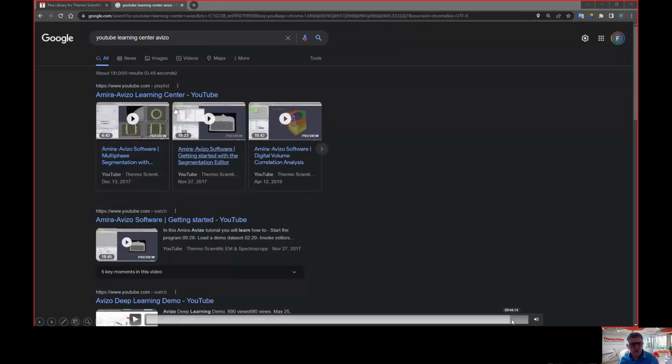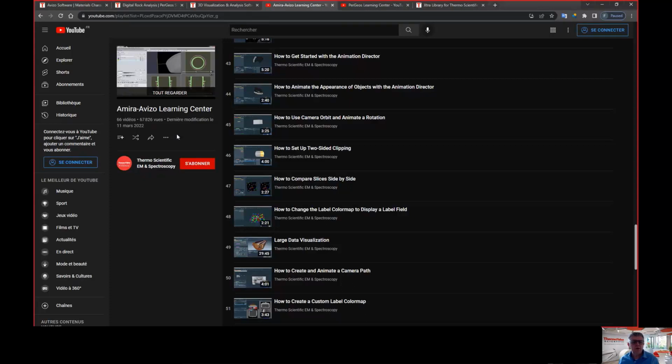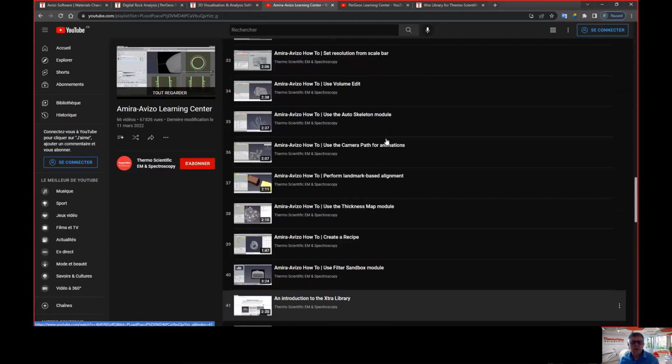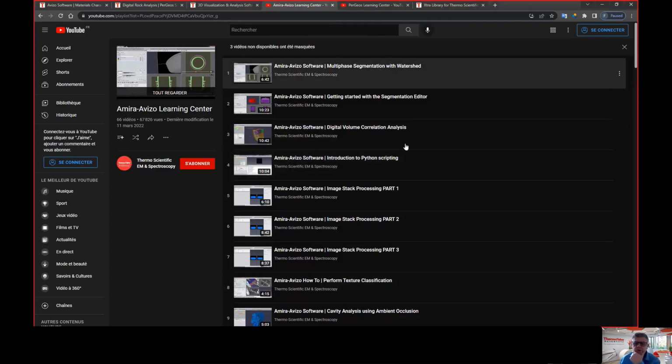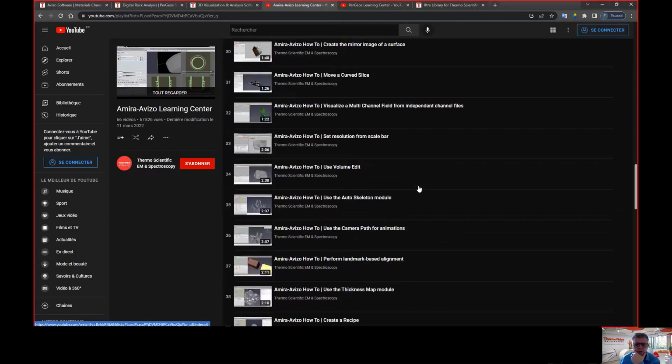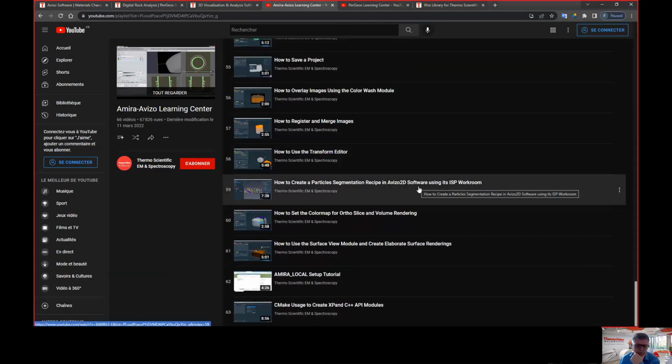Yeah, another resource online, very useful, the Learning Center. So if you type YouTube Learning Center Avizo, or you can type PerGeos, you will land, for Avizo, here. So you have plenty of videos that show you how to do things. Like, how do I do a multi-phase segmentation watershed? How do this, how do that? They are nicer than reading the documentation, basically.